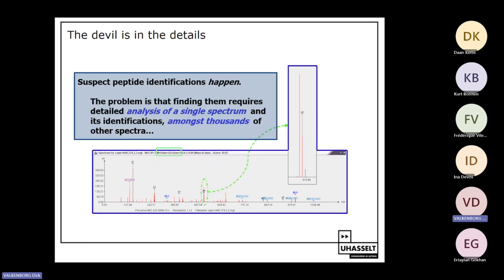So what you can see, the search engines generally work well, but we match peaks. And here what you see is an isotope pattern of a fragment ion, and here the second peak is annotated as a Y4 ion. So you really need to look at the annotated spectrum to assess the quality of your data.